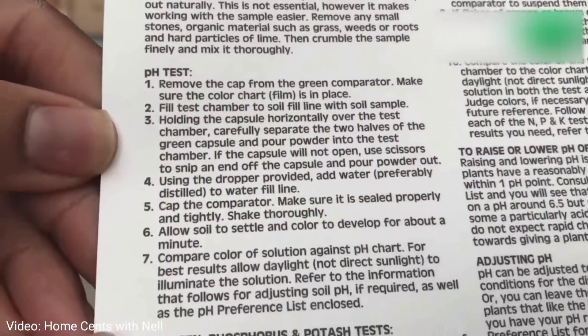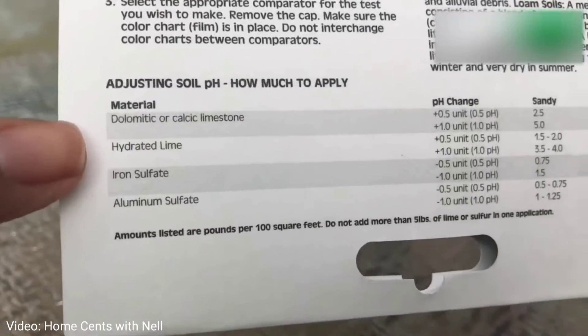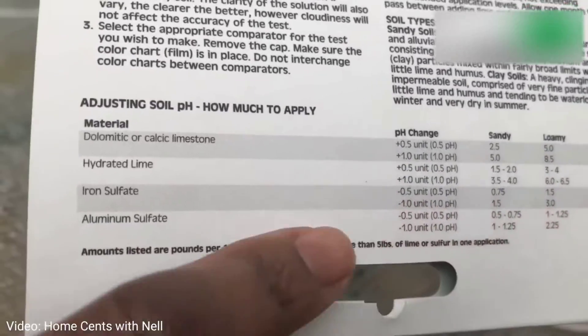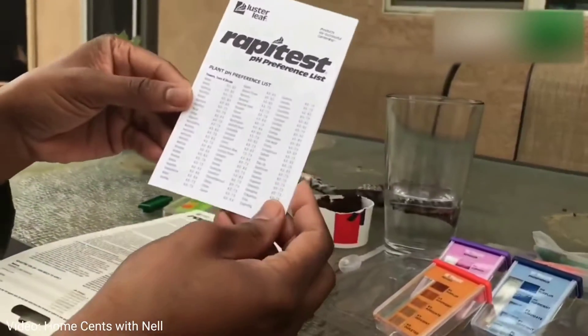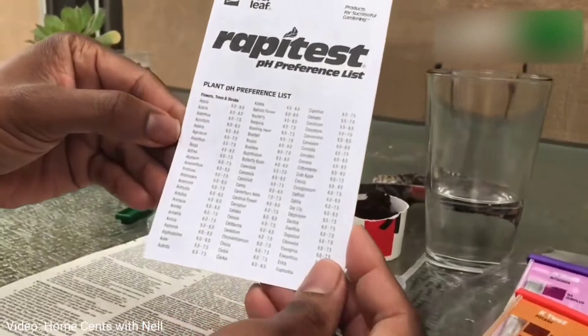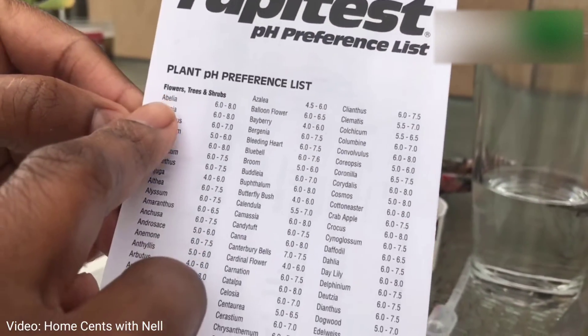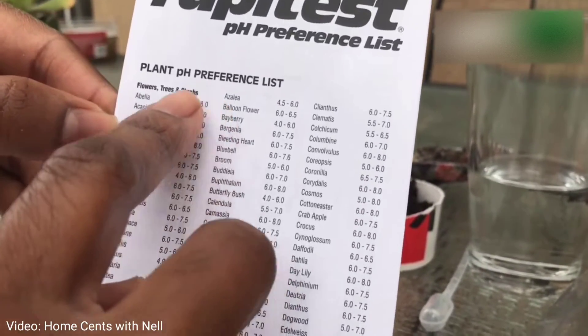This test allows you to analyze your soil — you can measure pH, and you can measure NPK which is nitrogen, phosphorus, and potassium, or in this case potash. What's great about this test is that after you get your results, the test will give you a reference list for pH which lets you know the ideal levels for whatever it is you are trying to grow.